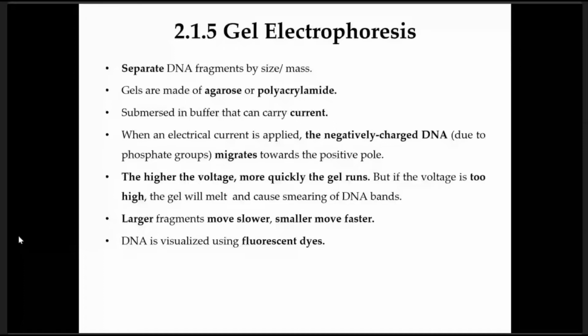Okay, DNA bands. So you have extracted genetic material from a sample of tissues. The DNA that you have collected, as we saw yesterday, you can collect DNA sample from semen, from blood, from bones.